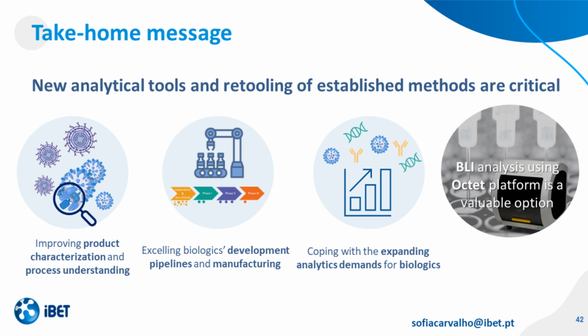And what shake speeds were used for analyzing the virus titers, since the purified proteins did not show any binding at the antibody or reagent concentration used? So we use 1000 for both loading and association.